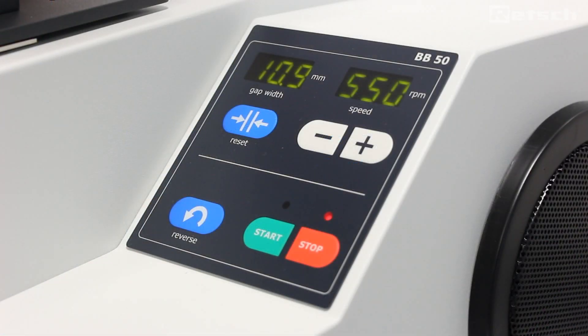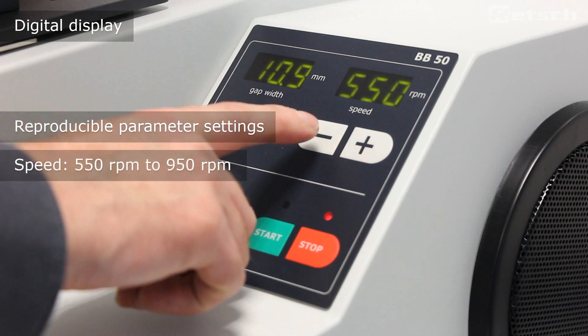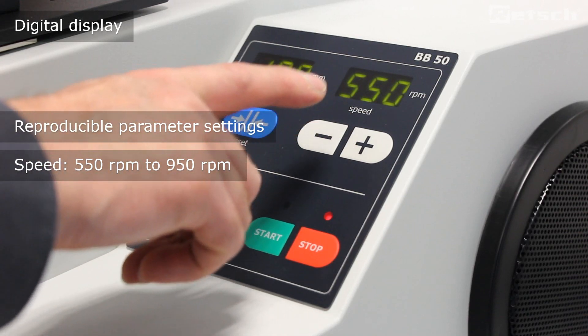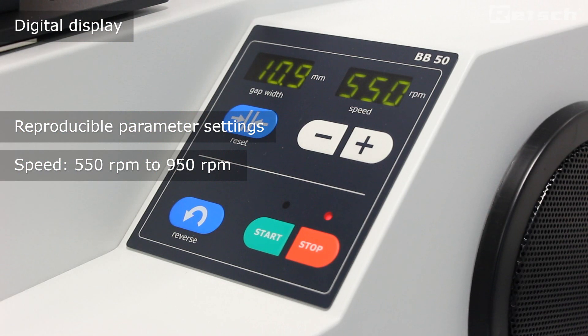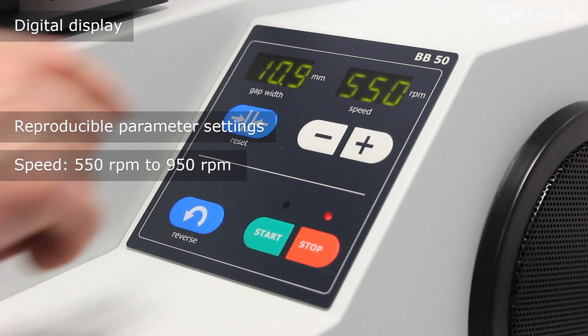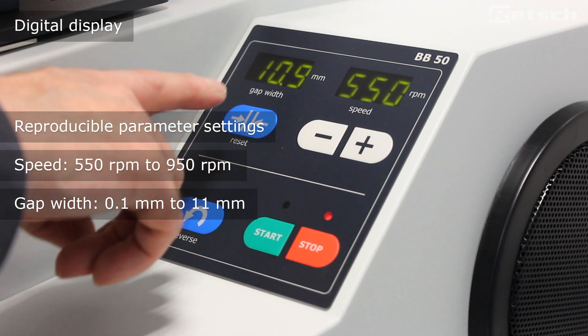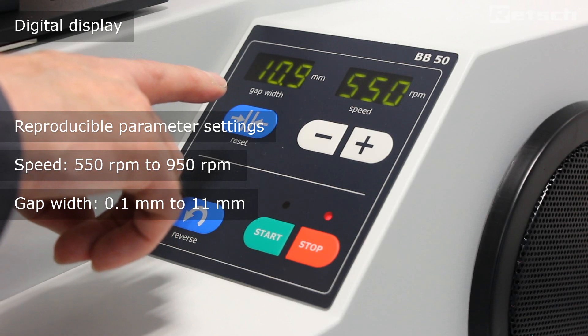The BB50 has a digital display which allows for reproducible parameter settings. Here we can see the speed setting, which is freely adjustable from a minimum of 550 rpm up to a maximum of 950 rpm. We can also see the gap width in millimetres, from a minimum of 0.1 millimetres up to a maximum of 11 millimetres.